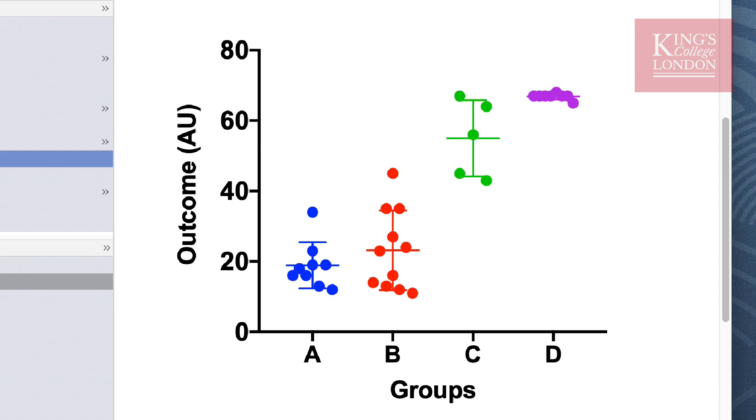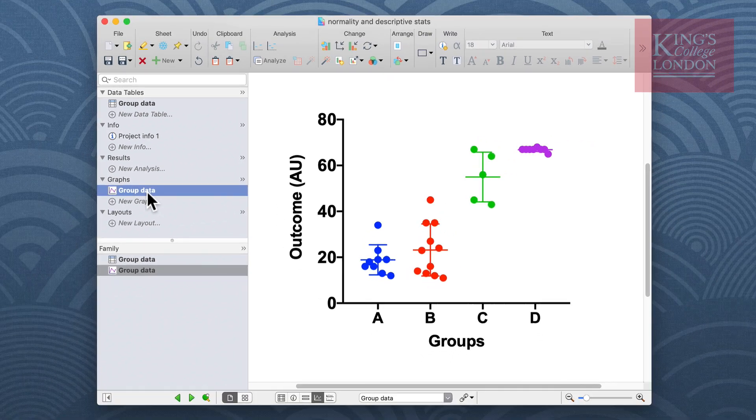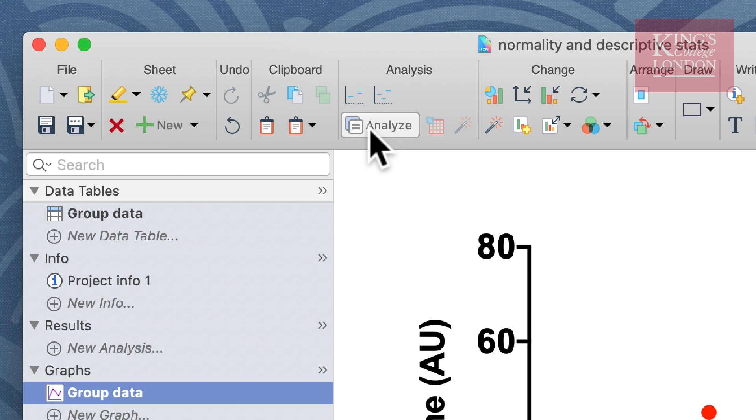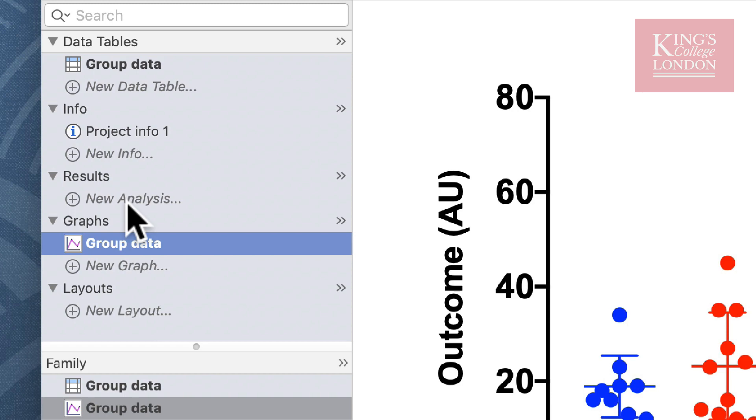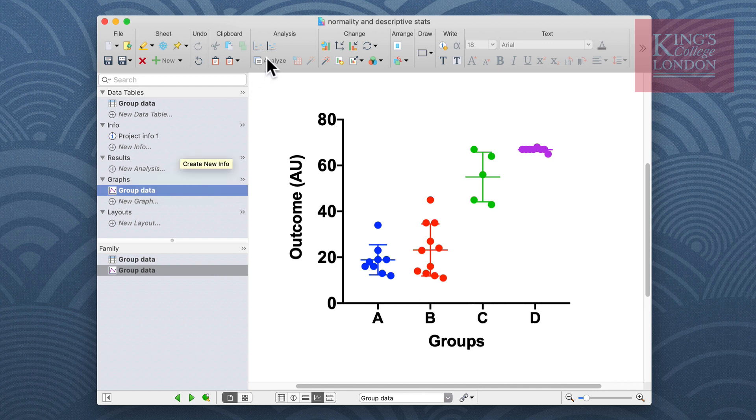You can carry out descriptive statistics on any column of data in Prism by clicking on the analyze button in either the graph or the table view or click on new analysis within the results window. In this example I'm going to click on the analyze button from the group data shown here in the graph.